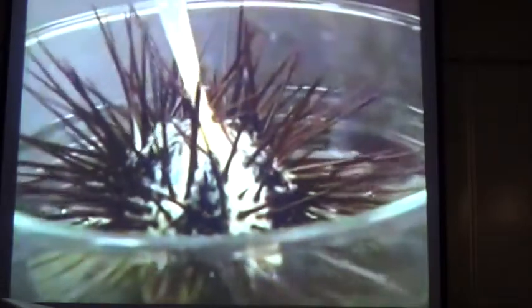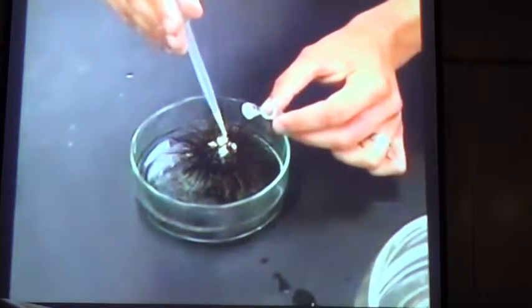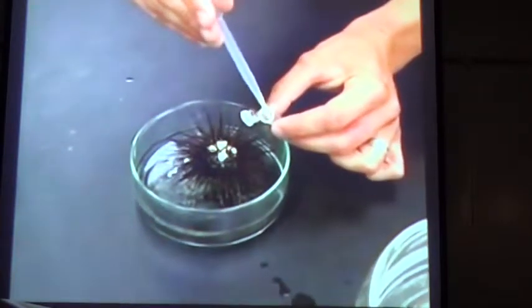If a white fluid is released, then you will know it is sperm. Collect the fluid with a pipette and store it on ice in a plastic tube.